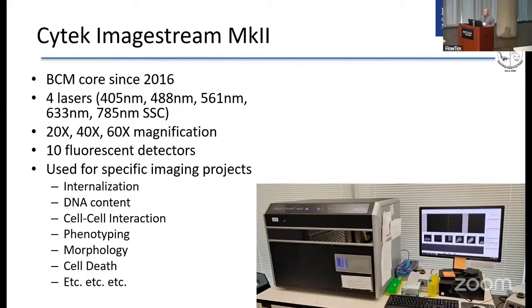This instrument has been in the core since 2016, well before I joined the facility. It has 4 lasers, up to 60x magnification, up to 10 fluorescent channels, and as Rob covered this morning, you can use it for a whole bunch of different applications, which I won't go into. In my mind, this is still regarded as the gold standard imaging flow cytometer based on image quality, number of fluorescence channels, and the relatively easy to use data analysis software that allows you to do very powerful analyses on your data.